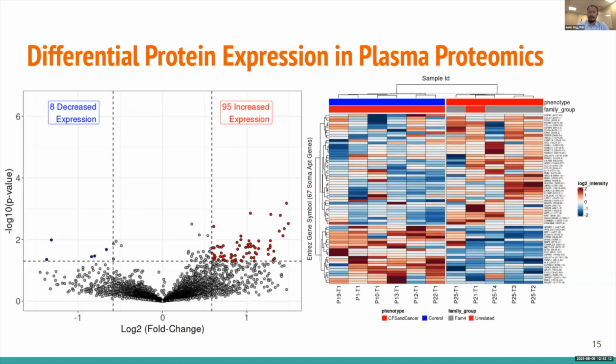So in addition to identifying clusters, we are also able to demonstrate the ability of identifying differentially expressed proteins using simple linear regression models. And we can clearly see that there are patient-specific profiles for key differentially expressed proteins in the heat map. However, for the purpose of the presentation, I won't delve into the specific differentially expressed proteins in this data set. Instead, I would like to highlight the power of the N-of-1 analysis, which focuses on a single individual, Vanessa, over time. This analysis will allow us to closely examine Vanessa's proteomic profile and its dynamics, providing more valuable insight into her own unique responses to disease progression. And by monitoring her changing proteome profile, we can gain a deeper understanding of the changes occurring at the molecular level and potentially identify specific pathways of proteins that are associated with progression of her disease state.